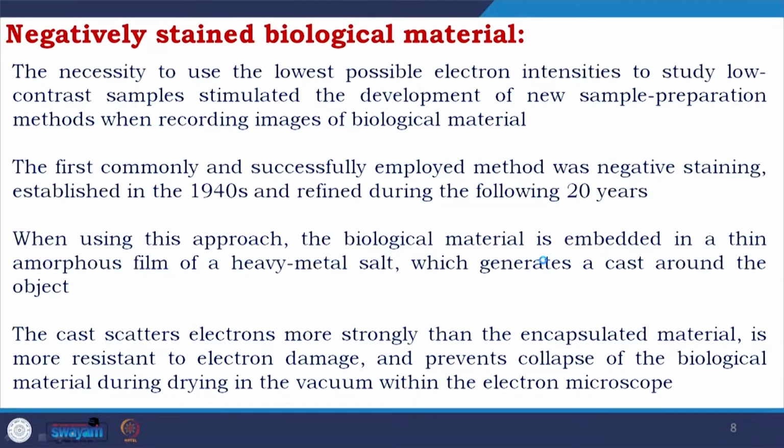The necessity to use the lowest possible electron intensities to study low contrast samples stimulated the development of new sample preparation methods when recording images of biological materials.